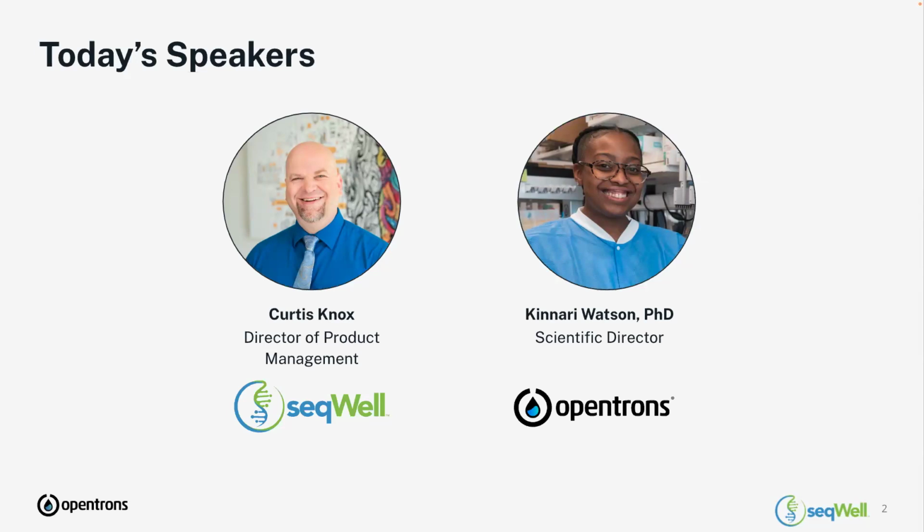We're very excited to hear about ultra-fast, high-throughput multiplexed library preparation of plasmids and amplicons using seqWell's ExpressPlex chemistry on the Opentrons Flex. So Curtis, over to you.